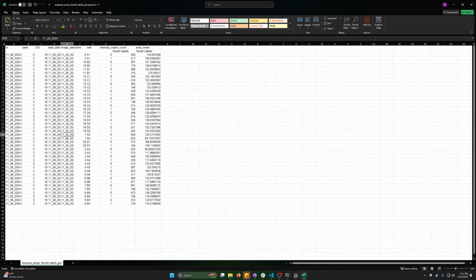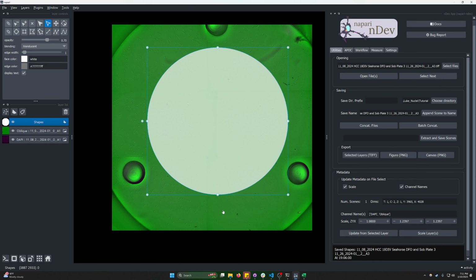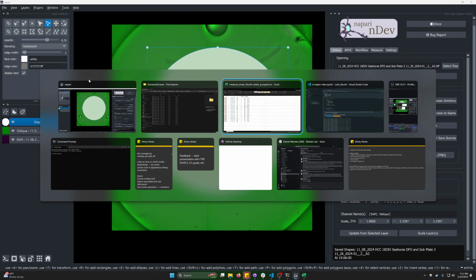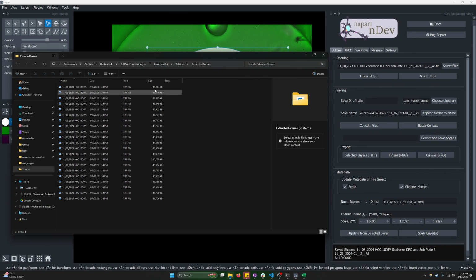this file, A2. We want to check A2 because it's got kind of a lot of cells not in the region of interest and maybe a little less than normal with a small size. So we're just going to double check. In order to do that, we can come back here. You could drag them in from your files. So what did we say we wanted to look at? A2. Oh, funnily enough, I think that's the one we were looking at earlier.